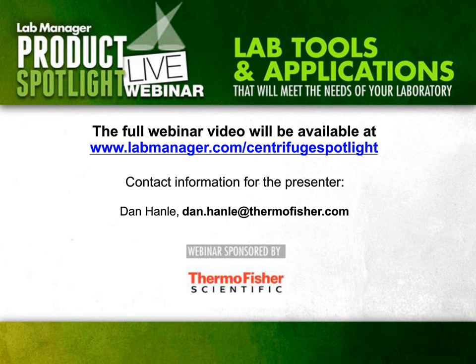Some people want to do that. But I'd say basically two things. Number one, look into the capabilities first. Don't just presume that needing 3 or 4 liters always was a floor model thing, so I've got to buy a floor model. Actually, we can do up to 4 liters on the bench now, and it's really good G-forces. So that might be it.